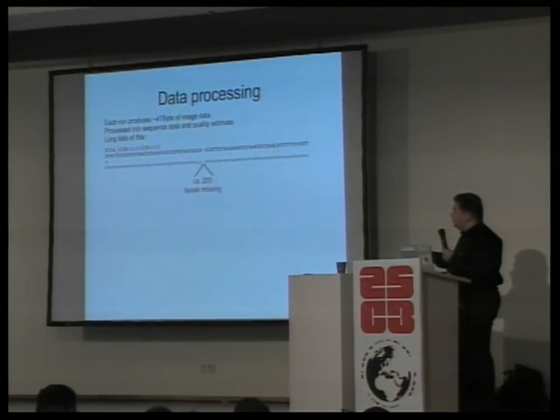This is, I think, 37 bases from one end. This is 37 bases from the other end. And there are, in this case, I think, about 200 bases missing. It's not that I cut them off because they don't fit on the slide. I don't have that data. This data is lost. So you only know the ends of these fragments, but not what's in between.